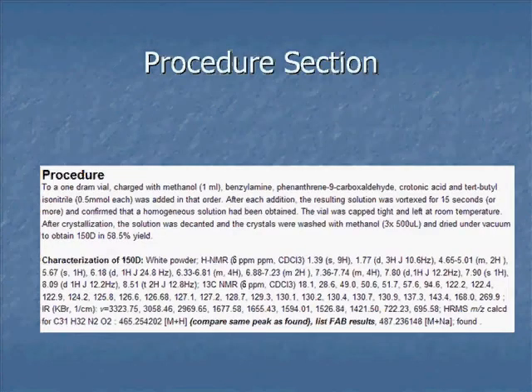And on the paper, all I'm doing here is taking that long page and dividing it up into sections. So there's also a procedure section typically, and this is something that we'd like to be able to copy and paste when this makes it to a traditional paper. We'd like to just copy and paste that to the experimental sections.